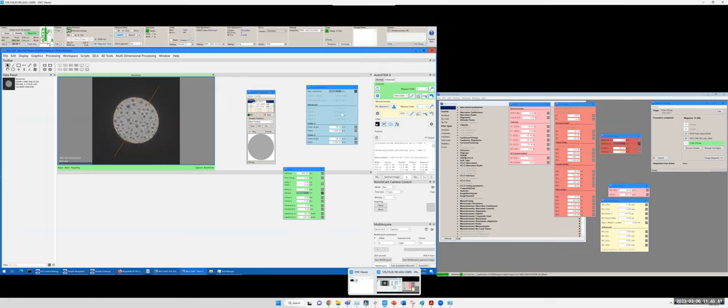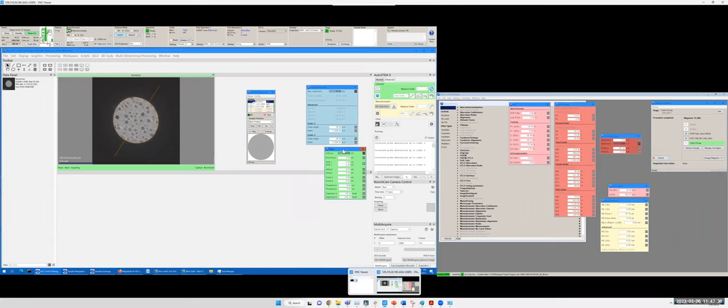If you look at this residue, right? Look at this number. I click third order, it changed once, but it does not change to zero. I click again, it reduced again, but not zero, okay. I finally click, it's zero now, but you can see there are still some lower order aberrations. So we can put some hand tuning here to make this process faster, because we can easily change astigmatism based on our eye. It will be very fast and accurate. So this is a little trick. You can also not do this and depend on the software to fix this, and it will work finally, yeah. But doing some human intervention just makes this process faster.